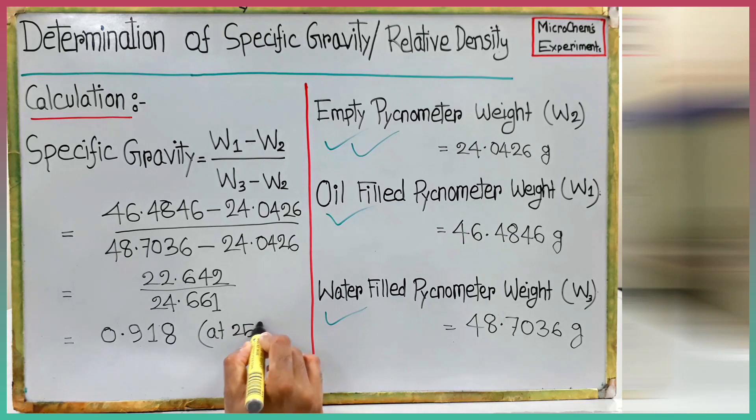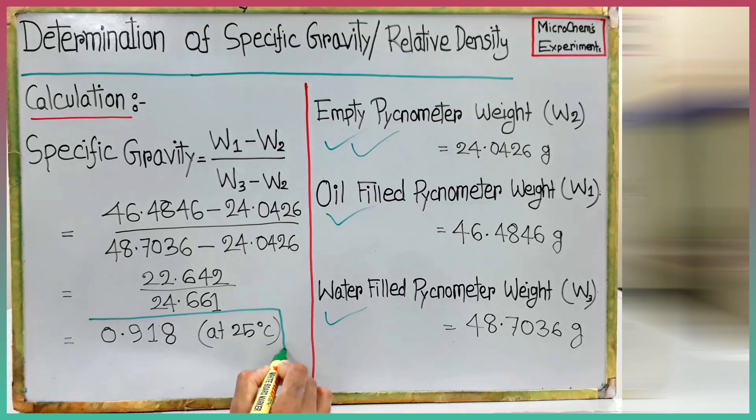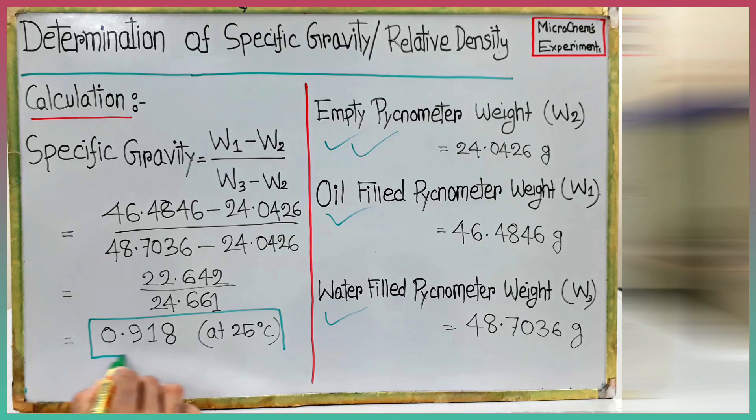In this experiment, we tested the sample at 25 degrees Celsius. If you need a test result at 20 degrees Celsius, then you have to set your water bath temperature at 20 degrees Celsius instead of 25 and carry out the whole experiment as done in this video.